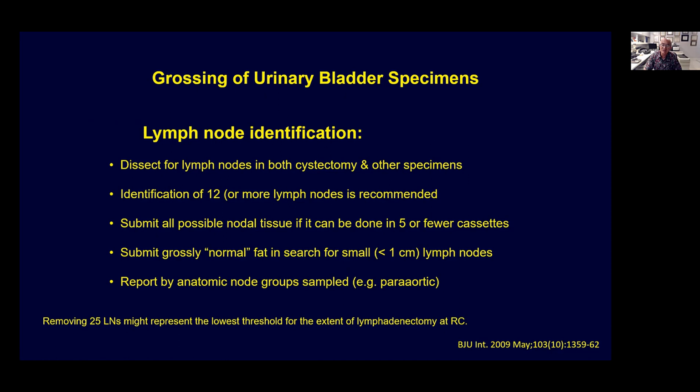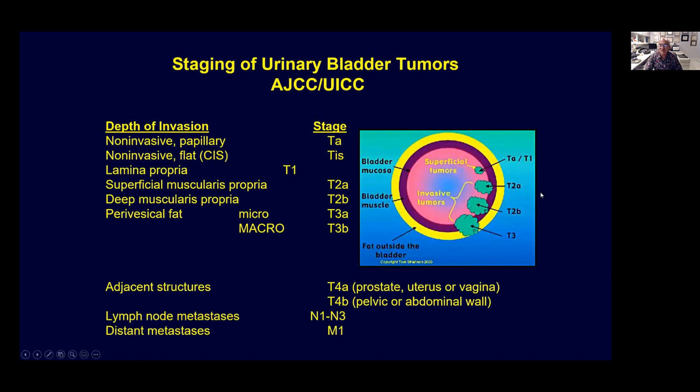And in those cases, we just had to go back to the bucket and start looking for more lymph nodes to fulfill these requirements, so that these patients are treated properly, and there is documentation that a good lymph node dissection has been done. Otherwise, the surgeon is the one who is responsible for that. And well, this is again an identification of the different stages.